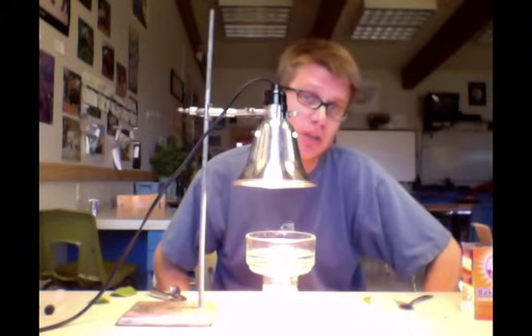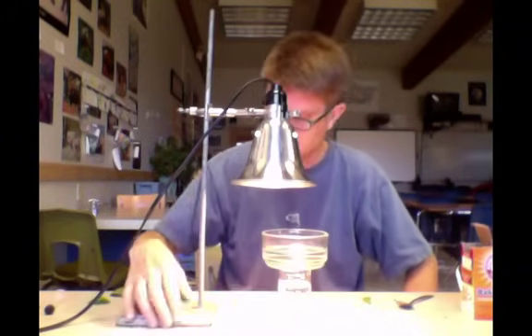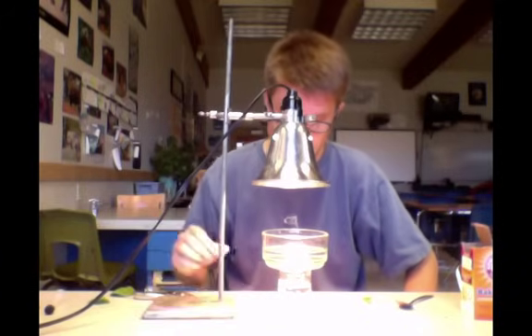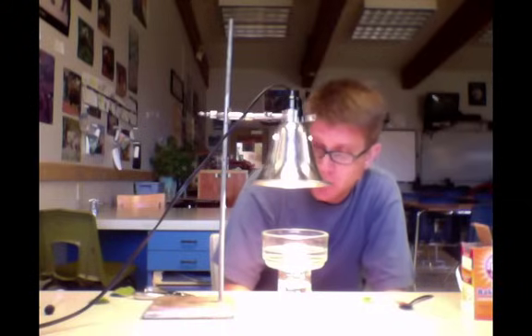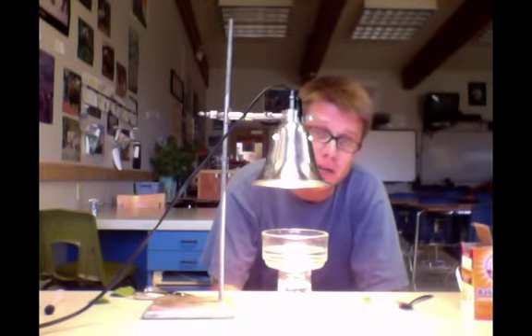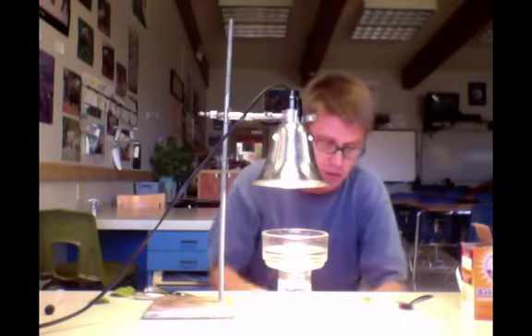Things that you could study, you could study for example how the concentration of baking soda or concentration of carbon dioxide affects the light. You could look at the color of the light. You could look at different temperature of the water inside there. And you could see how all of those things affect the rate of photosynthesis.